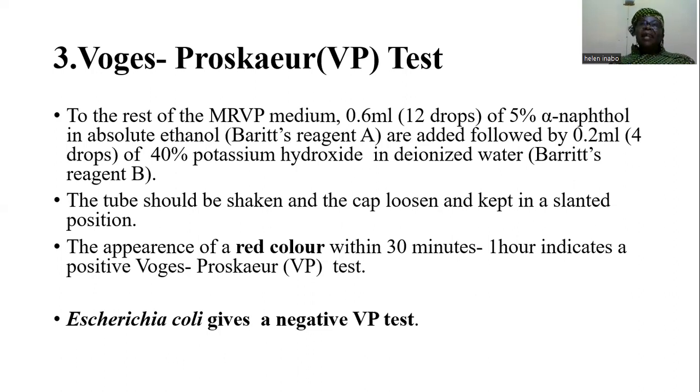The diacetyl reacts with the guanidine group associated with molecules contributed by peptone that is present in the medium.